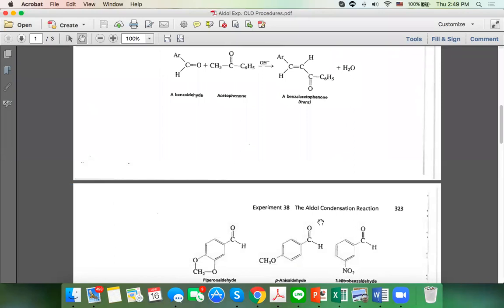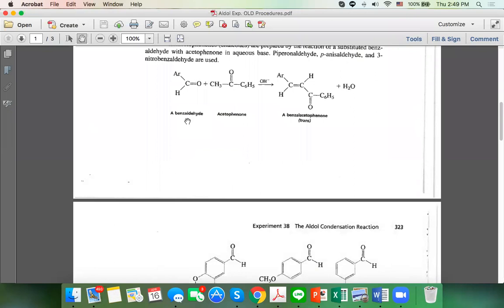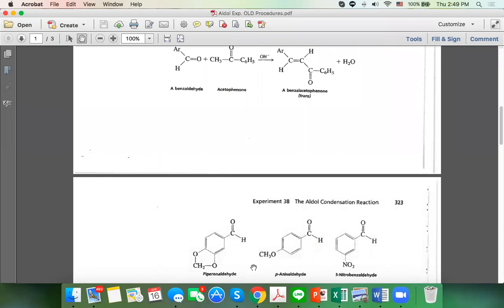Now, remember I said scientists use a lot of other new molecules. And look at the benzaldehyde side. Instead of a clean benzene group here, a phenyl group, they add so many different things, okay? And in one of your reactants, I'm talking about your manual, okay? We're not running the reaction with these, no. We use benzaldehyde, then we use methoxy, okay? And we're using cinnamaldehyde, right?